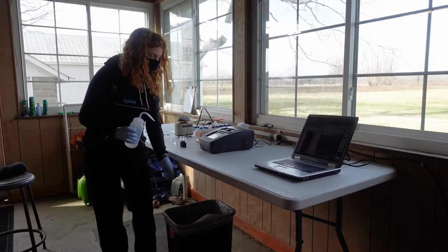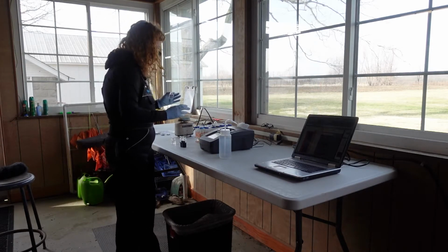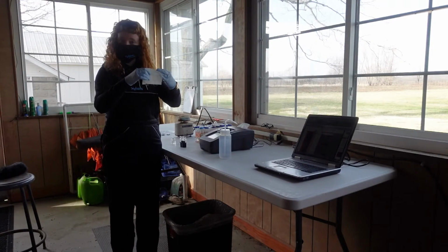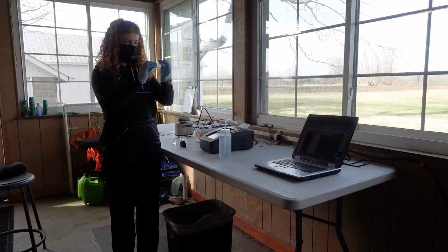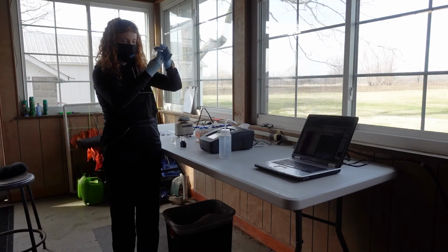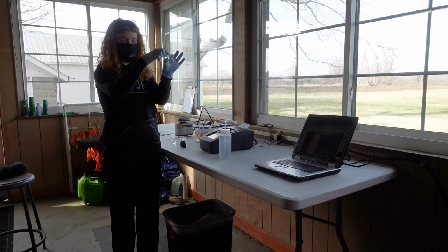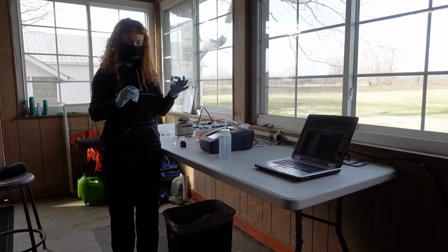And dump. If in the process of rinsing, I've gotten some water on the outside of the cuvette, take a Kim wipe. Not a paper towel, so Kim wipes are lint-free. They won't leave any debris on the optical windows, so I'll wipe the windows. And notice throughout this process, I'm not touching the windows of the cuvette. I'm holding it by the top.